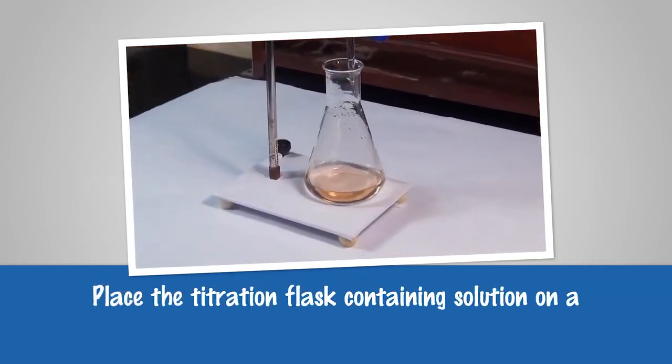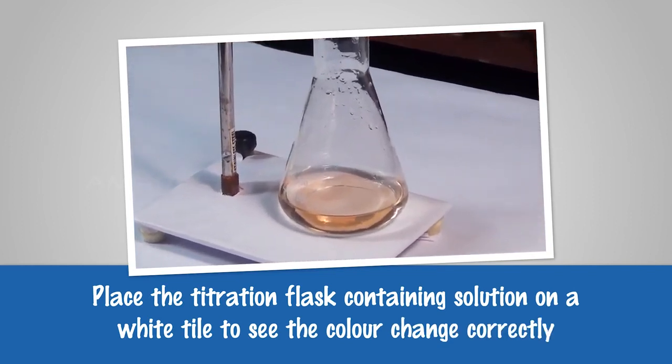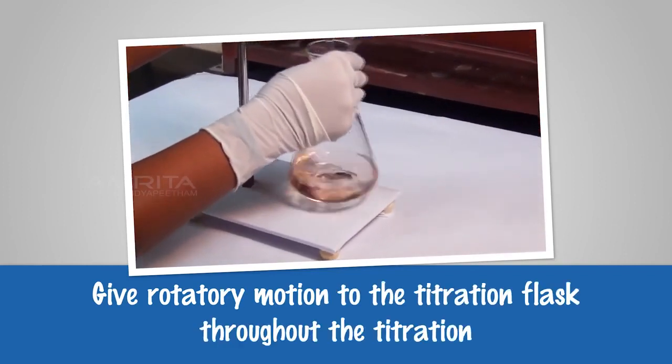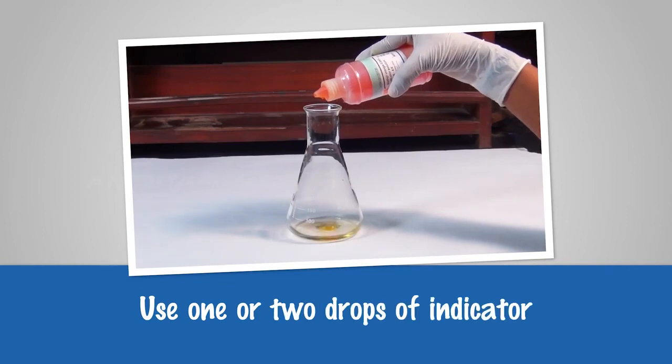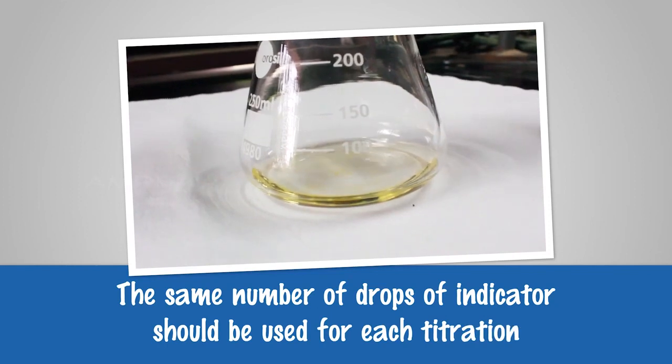Place the titration flask containing solution on a white tile to see the color change correctly. Give rotatory motion to the titration flask through the titration. Use 1 or 2 drops of the indicator. The same number of drops of indicator should be used for each titration.